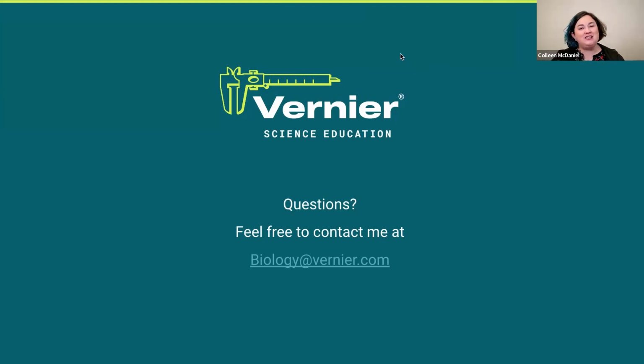So what I tend to recommend, and I did an activity back last November that we have a recording of, a webinar about acid rain and ocean acidification, is using a pH probe and measuring CO2 by the relationship of carbonic acid forming in the water due to the introduction of CO2.